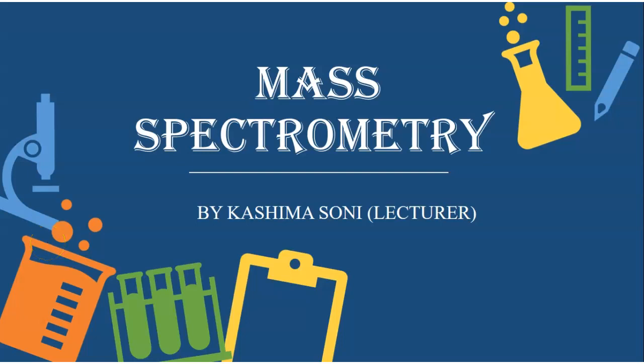This is Kashima Soni and today we are going to discuss in detail the next ionization technique, that is desorption ionization technique, that includes SIMS, FAB and MALDI. So we are going to discuss the third ionization technique, after chemical ionization technique. This is the one that we are going to discuss today.